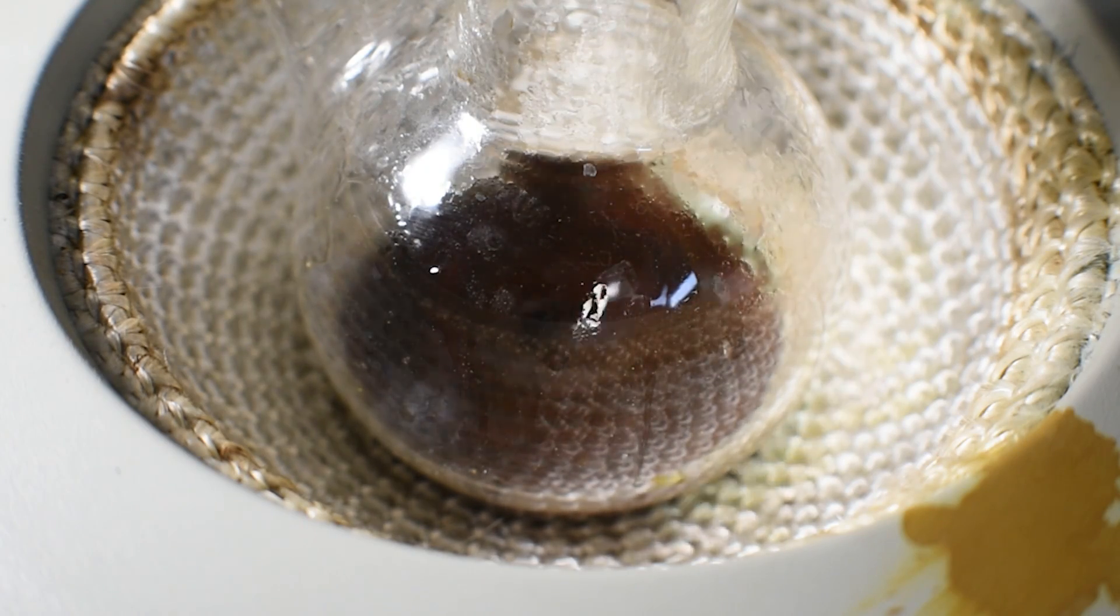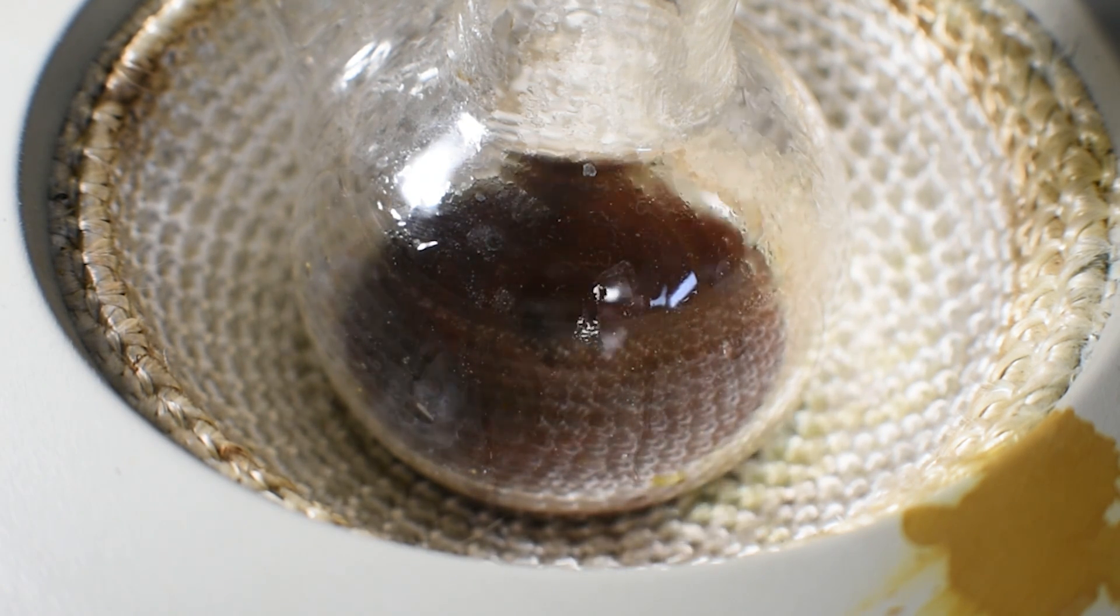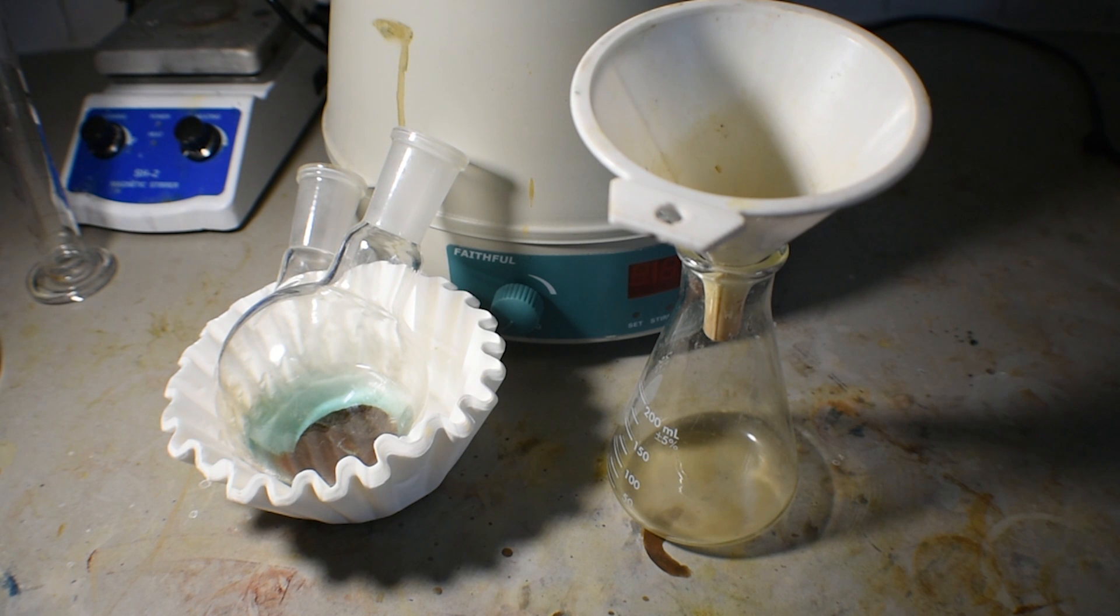Once the solution had become almost completely red in color, it was taken off heat and allowed to cool outside, so as to let any remaining sulfur dioxide escape the flask. After a few hours, it was ready to be processed through a simple gravity filtration setup comprised of a filter funnel and filter paper.